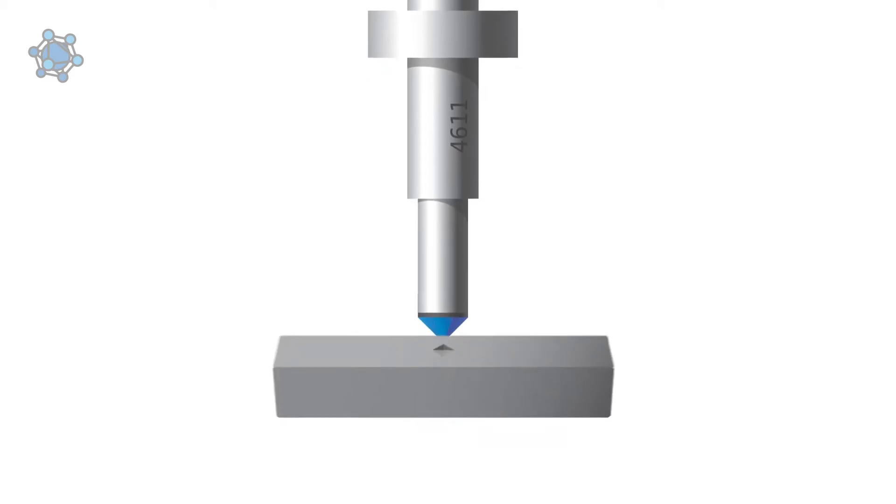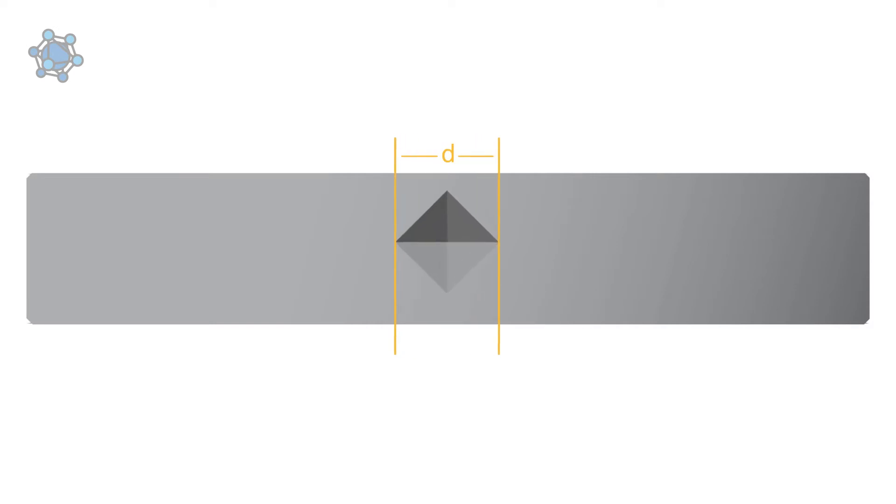The resulting indentation is then measured. The softer the material, the larger the indentation, and the harder the material, the smaller the indentation.